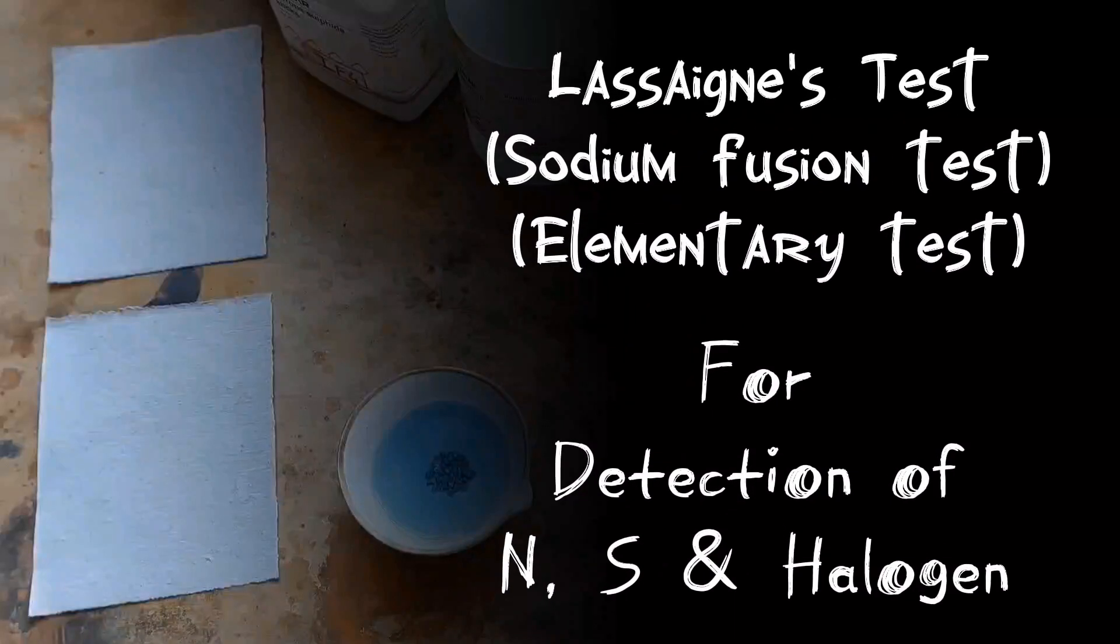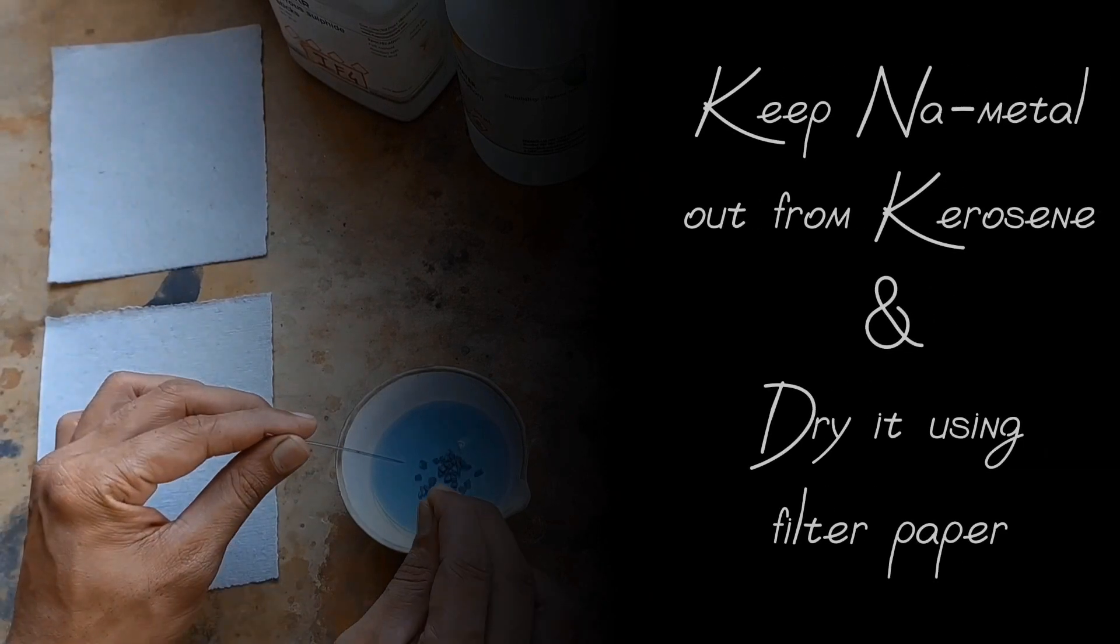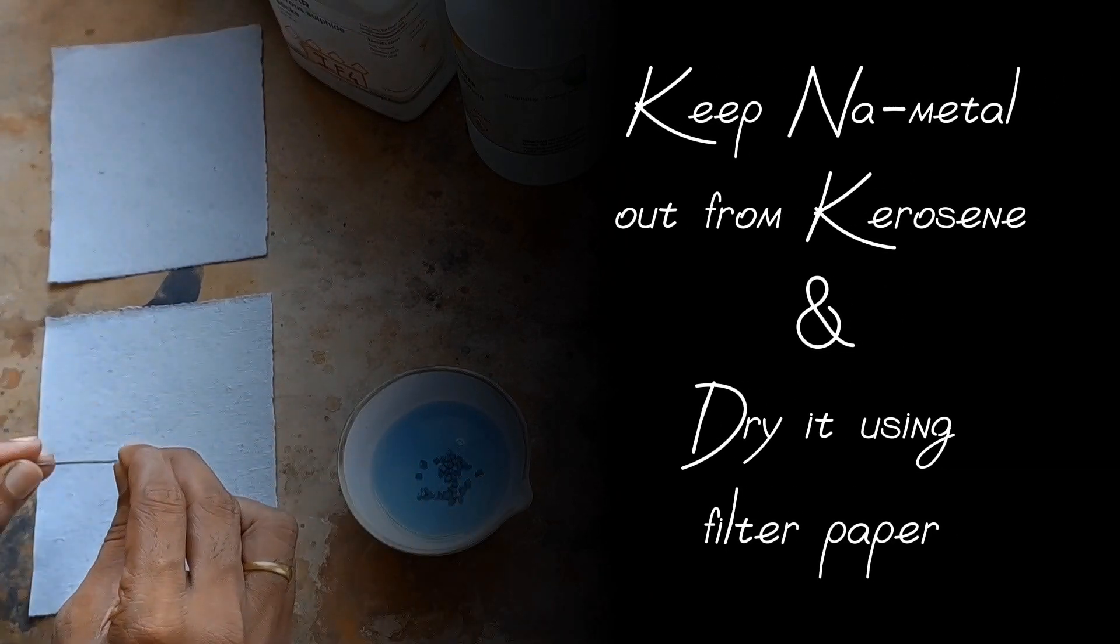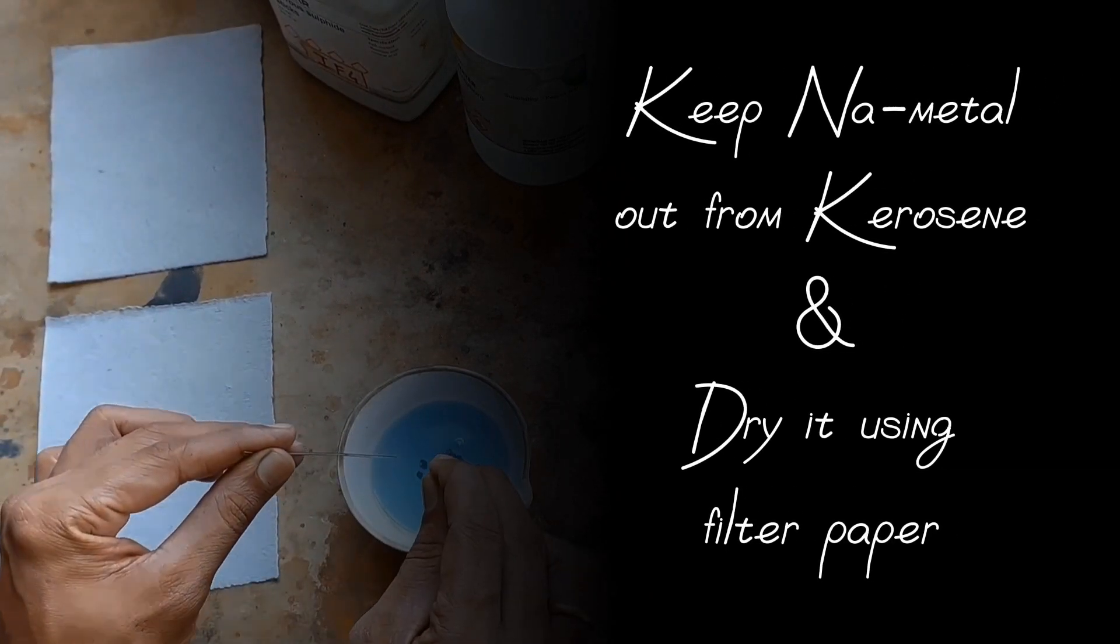Lassaigne's test for detection of Nitrogen, Sulphur and Halogen. Keep sodium metal out from kerosene and dry it using filter paper.